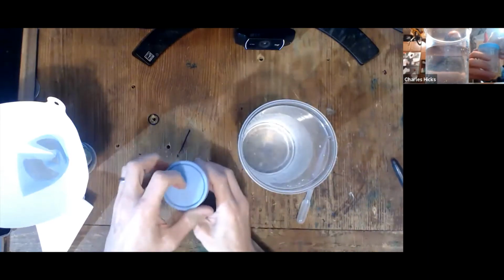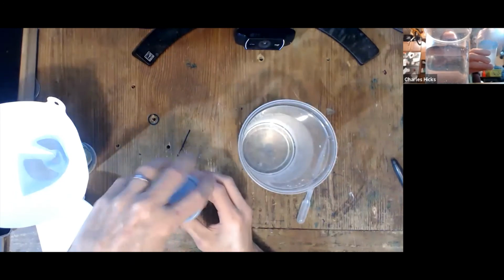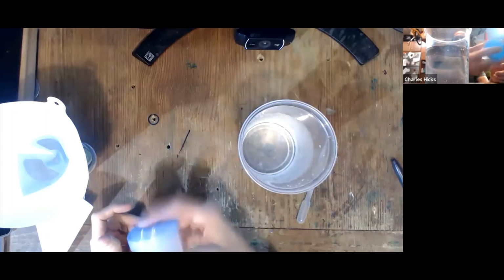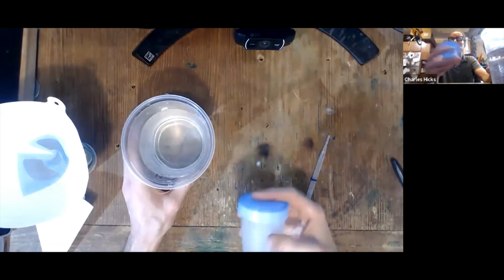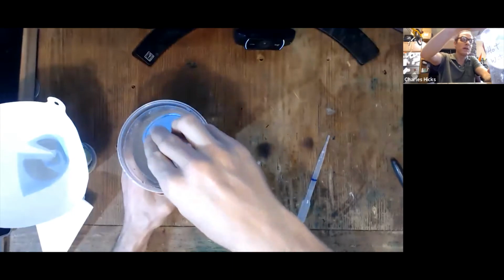Put the cap on this container. Make sure you close it securely. We're going to shake it. You want to give it a shake. And we want to keep this at about the same temperature so that it doesn't cool down too much. So we're going to use the rest of this hot water as a hot water bath. So take the container after you shake it up a little bit and immerse it in this bath.